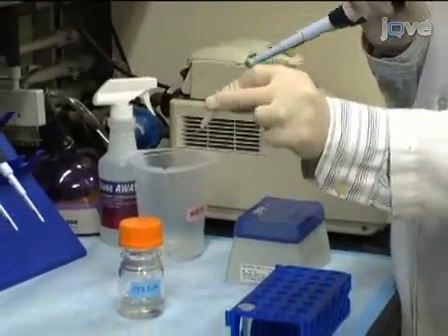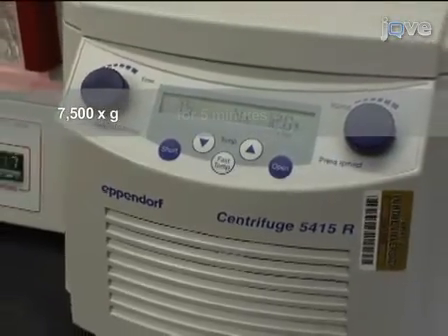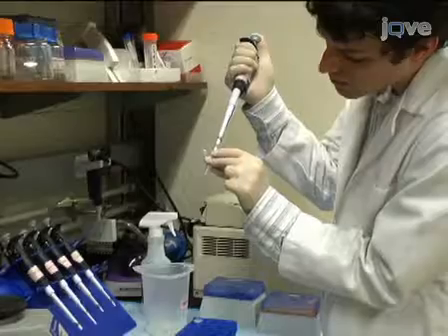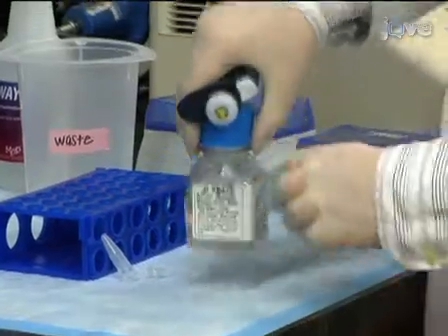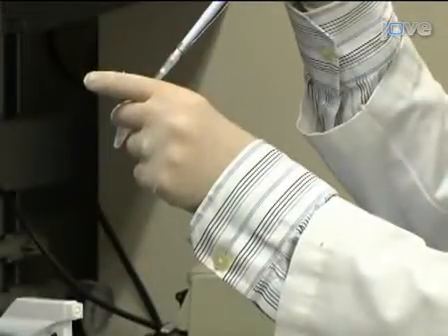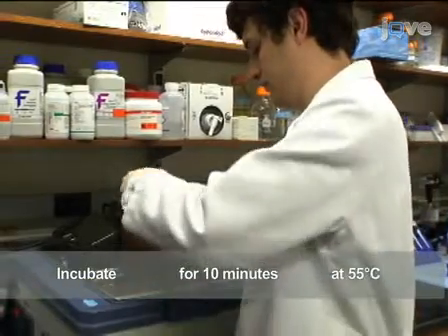Mix by gentle inversion. Centrifuge at 7,500 g for 5 minutes at 4 degrees Celsius. After centrifugation, remove the ethanol and invert the tube to dry for 10 minutes. Re-suspend the pellet by adding 100 microliters of RNase-free water and incubating at 55 degrees Celsius for 10 minutes. Finger vortex frequently to aid in RNA rehydration.